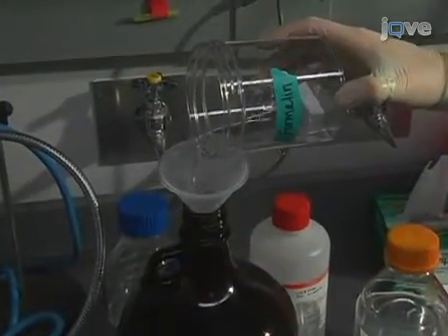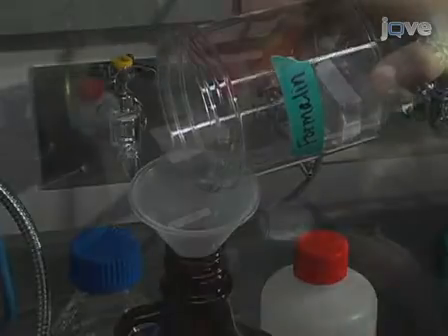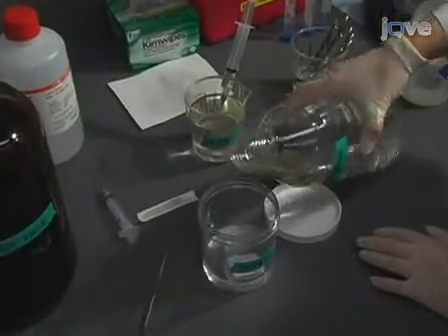Leave at room temperature for 24 hours to fix the tissue. After 24 hours, pour off the formalin and replace with 70% ethanol for an additional 24 hours. Colons can be stored in 70% ethanol indefinitely at room temperature.